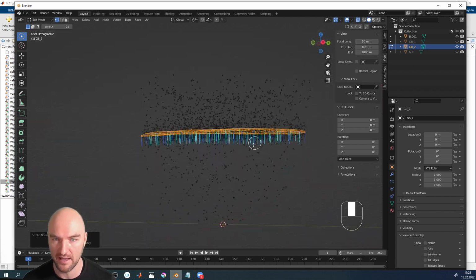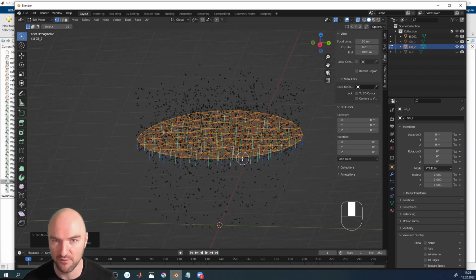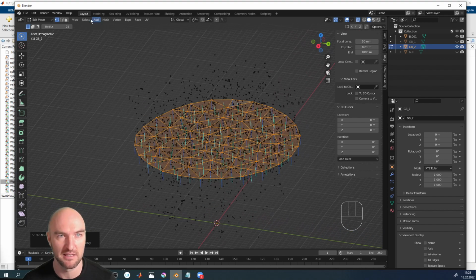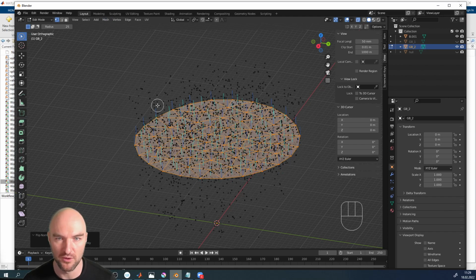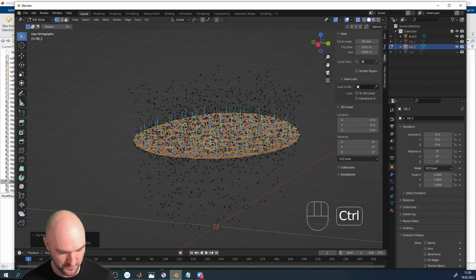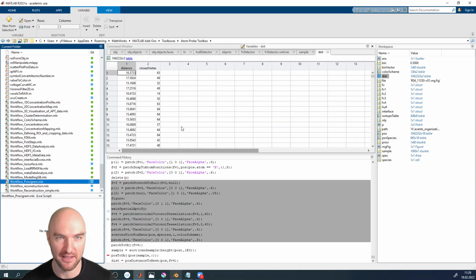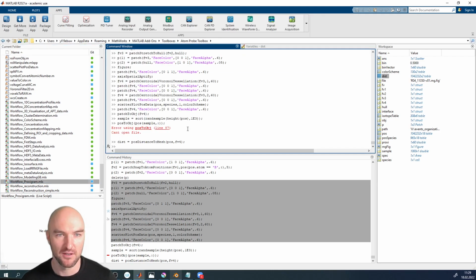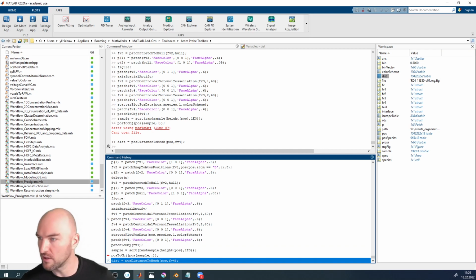We need to know which way they point, especially if we hand model the grain boundary, hand modeled anything, you might want to check if all of your normals are consistent. And if they're not consistent, you go to Mesh, Normals, and then recalculate inside, recalculate outside, or flip them all if you want them to point into a different direction. So this was the original direction we had. This is just something you really need to take into consideration. Okay, so now we've got the distance calculation, and I will just copy that into the.